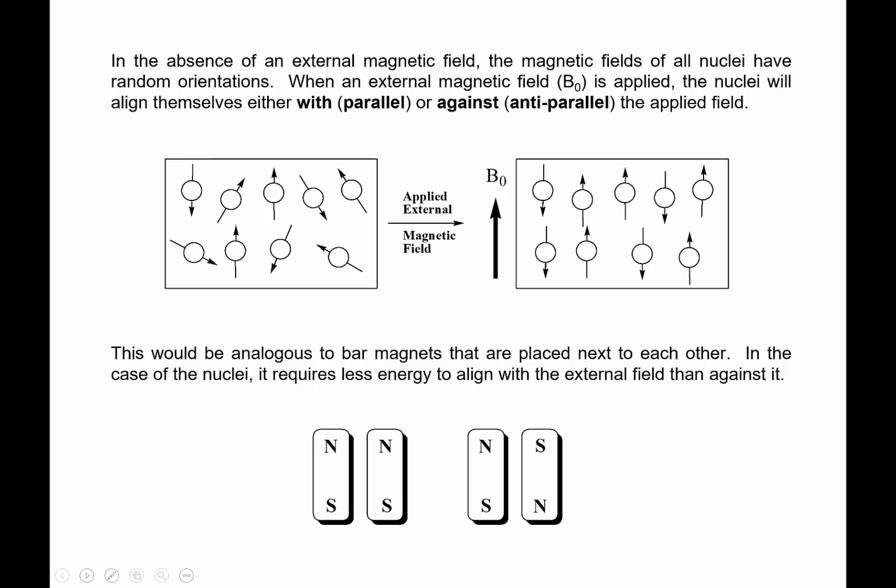Now I'm back to spectroscopy. We talked about the light and the molecules needing to be in the right state. I've now put my nuclei in there. It's sort of analogous, but whether the magnets are smacked together or pushing away, I'm not even going to try to make that analogy. For the nuclei, being with or against the field is the most important part.